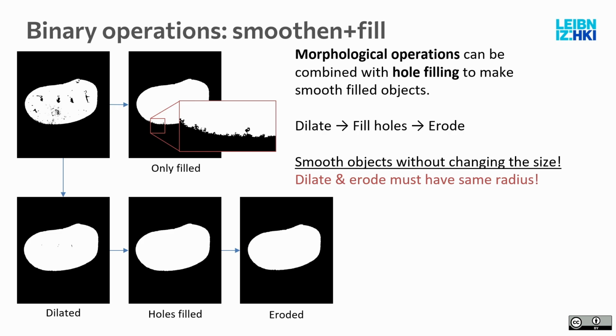It's actually zoomed out a bit. So far I showed you only the glomeruli, but this is actually from a study where these clearing methods were showcased for light sheet. It was light sheet data here. And there they wanted to compare the tissue sizes as well, so they needed to do the segmented tissues. Simple auto thresholding gets you that here.